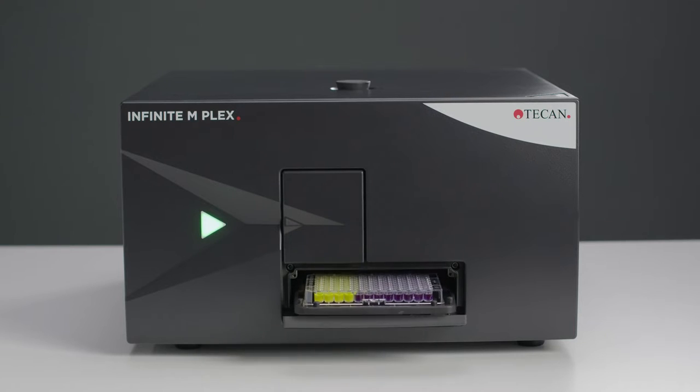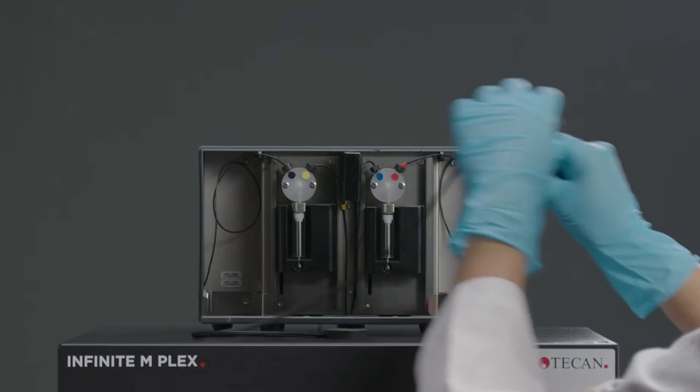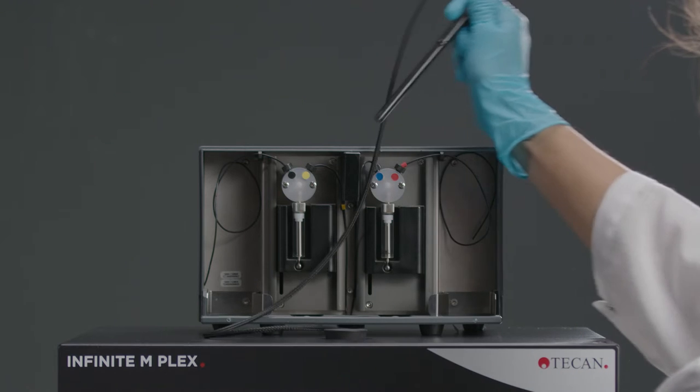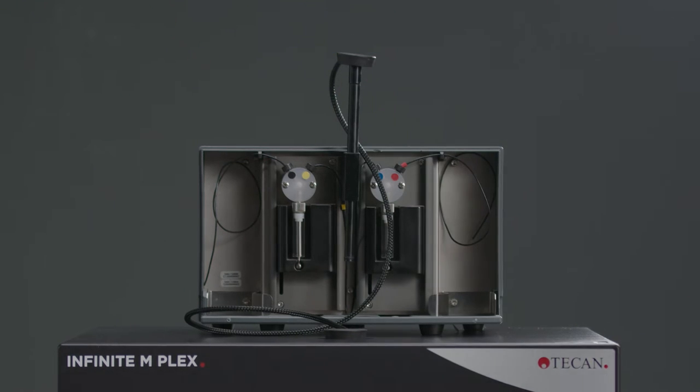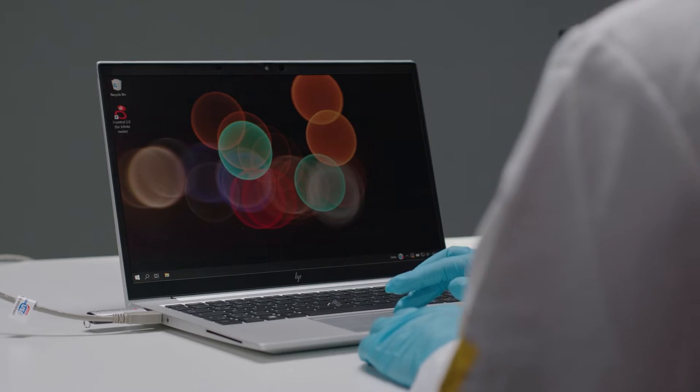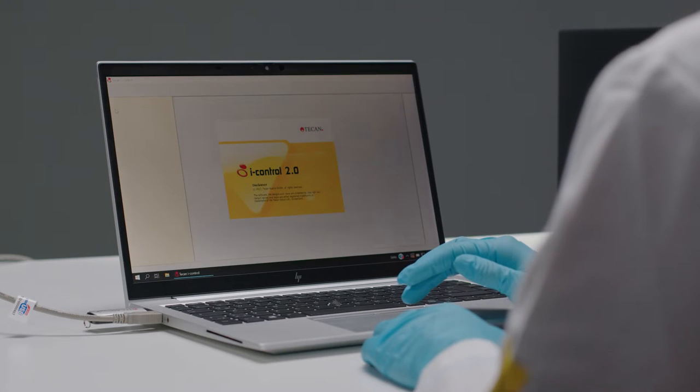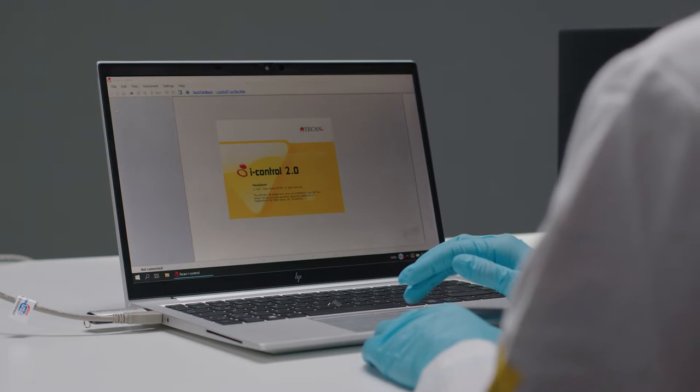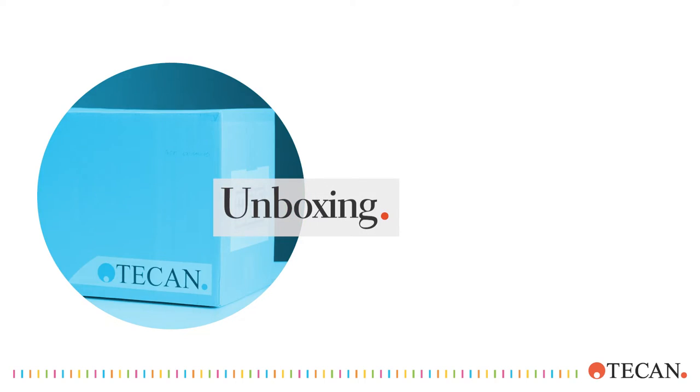Useful accessories like the nanoquant plate, a cuvette port, or injector modules give you even more great tools for the lab. The iControl software helps you to control your instrument. Let's get started.